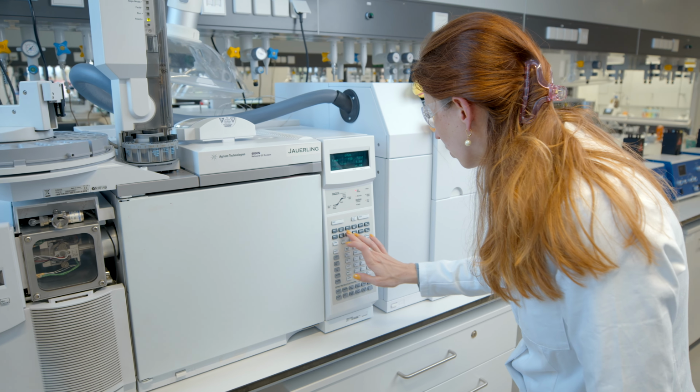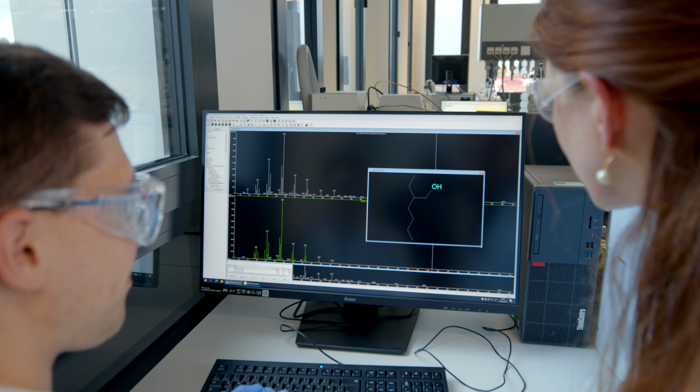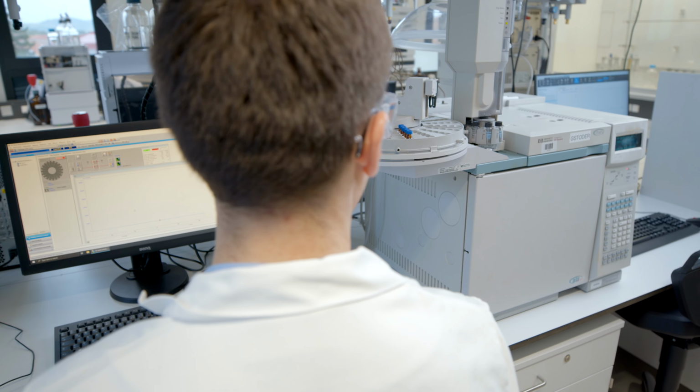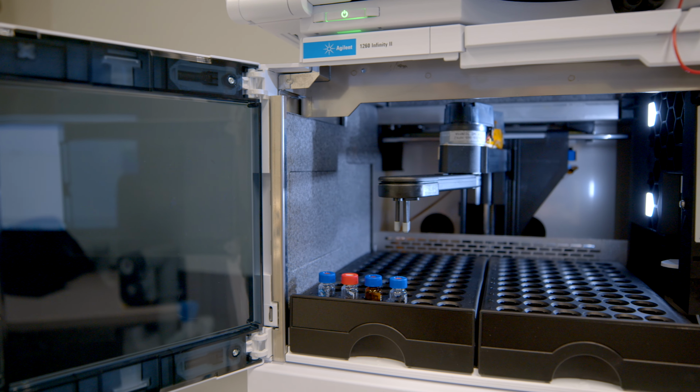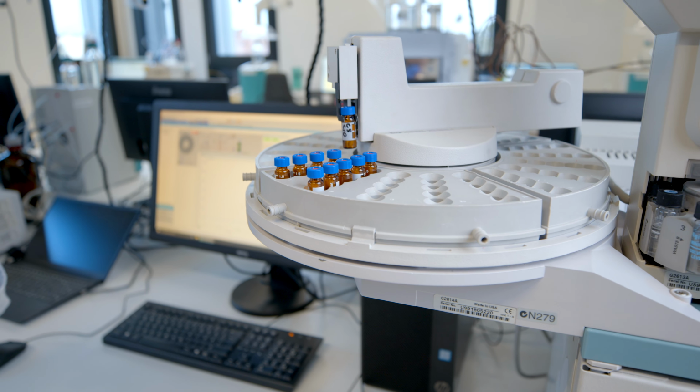Now we are standing next to the mass spectrometer. This is a device that I would say is the cherry on the top, because it allows us to identify the compound. We will learn with you how to do the experiment by means of this mass spectrometer. For example, we can analyze different spices. We can also perform the pesticide analysis or determine some fungicides on the peel of some citrus fruits and so on.